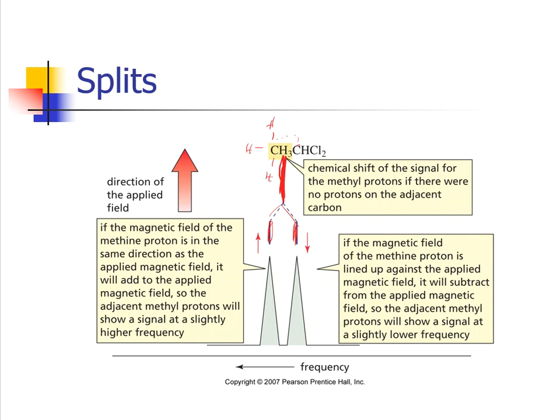Well, we start off this basic because I think that it allows us to explain this a little bit better. But these protons have a spin that's associated with them to create that signal. And then when you go next door, that next door carbon had 1 hydrogen, right?